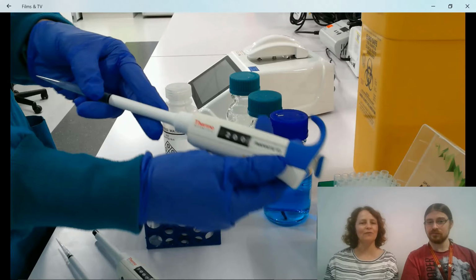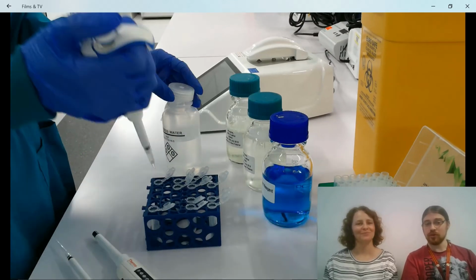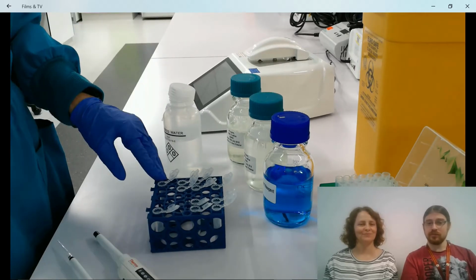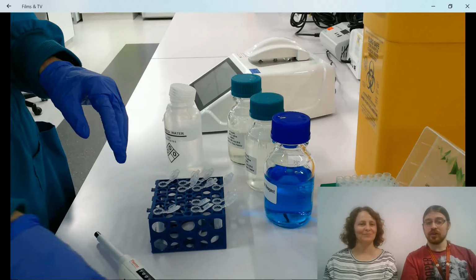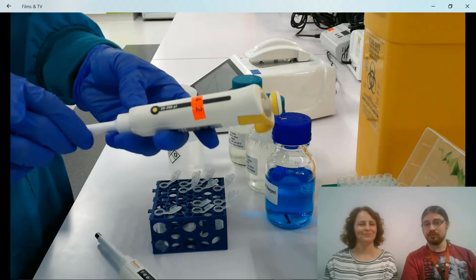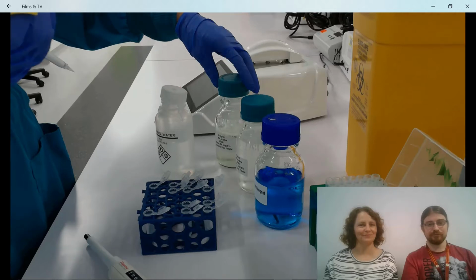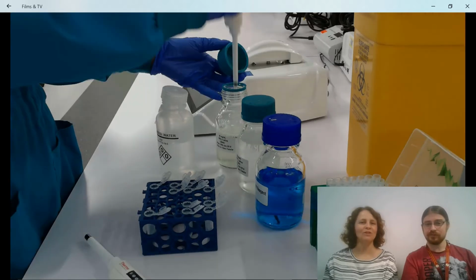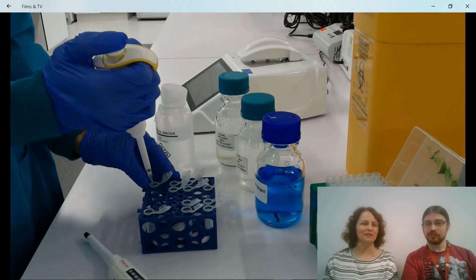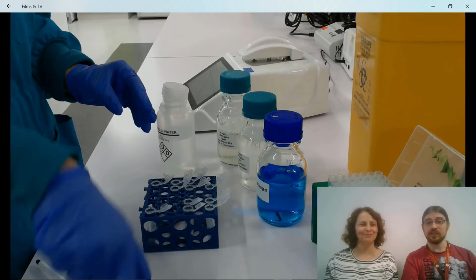So here we have the P1000, and they're taking 200 microliters of water into their Eppendorf tube. To this water, they're going to add 50 microliters of test sample using a P200. Watch their pipetting technique while they do these things. It's always good to watch other people's techniques to see if you can improve. Definitely.